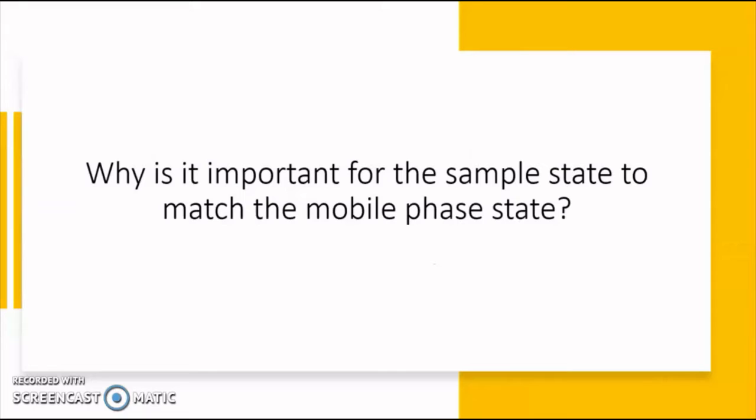Before we begin, I want you to think about the following two questions. What is the physical state of our sample? And how does that physical state of our sample relate to our method of detection?